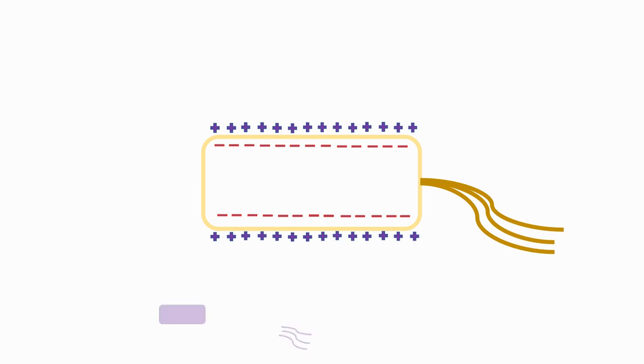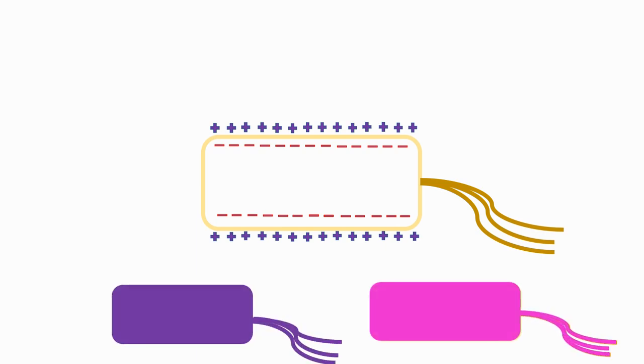We have learned that bacteria are negatively charged and they attract positively charged dyes or basic dyes. At the same time, we should note that being gram-positive or negative has nothing to do with the electrical charge of the bacteria or the charge of the dyes. It simply differentiates between the bacteria that get stained with the primary dye from those that take up the secondary dye used in the gram stain.